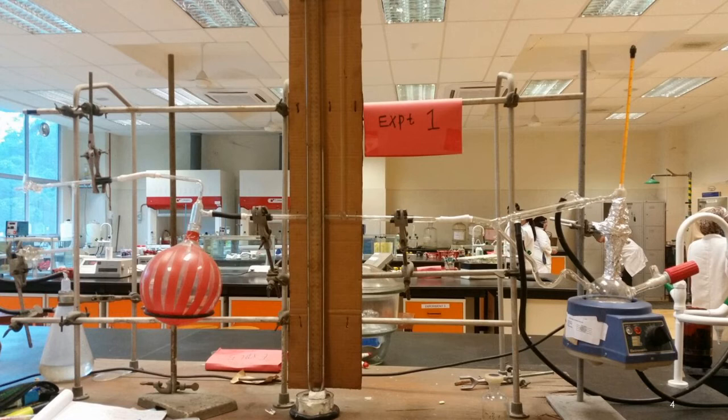You start increasing by introducing some air into the system. This is air, so this tap is connected to air. Open it a little bit, and the pressure will start increasing. When the pressure of the system increases, the tert-butyl alcohol will stop boiling, because remember, now it has a new pressure, and a new pressure means a new boiling point.